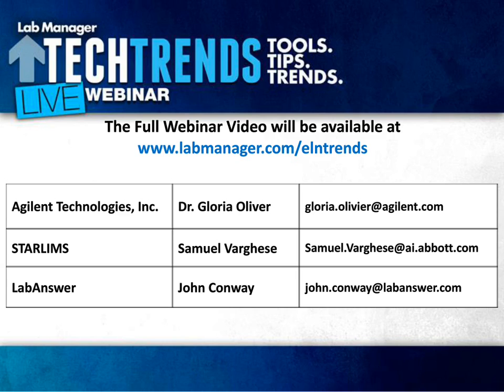Because it's a very method-driven environment. So, it's one step, collect results, move on, get the okay to move to the next step. So it's an electronic SOP where you walk through the different phases or the different steps of that particular method. And then there's particular sign-offs needed, certificates formed, whatever the SOP dictates, that's what the template follows. In a research space, it can be a little more free-thinking and open. You could have a hypothesis, but then you can go off and explore several different scenarios, record that all in your notebook, and then get your notebook signed and countersigned.